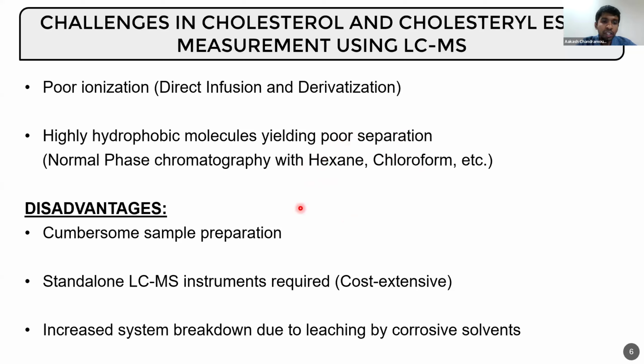Both these approaches include a lot of cumbersome sample preparation techniques, and these involve standalone LCMS instruments, because these molecules during direct infusion or use of corrosive solvents like hexane generally require a lot of support, and they include a lot of system breakdowns. To bridge the gap, we wanted to develop a simple LCMS technique.